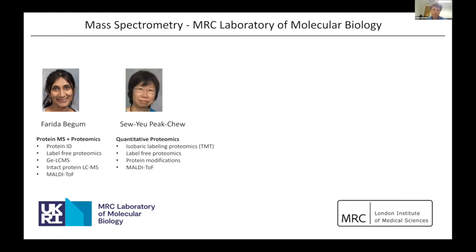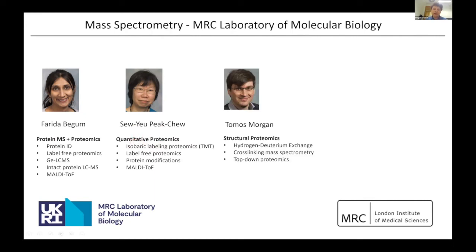Sue, who works quite intensely on a method called isobaric labeling proteomics, or TMT-based proteomics. And I will cover this in the next lecture. And then Thomas, who has joined us more recently, working on structural proteomics, both on hydrogen-deuterium exchange mass spectrometry, as well as cross-linking mass spectrometry.